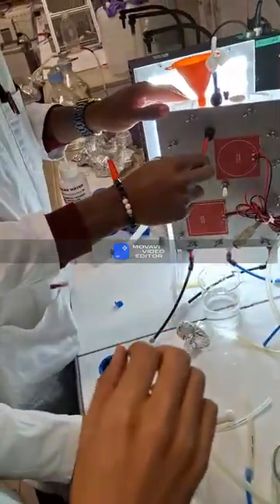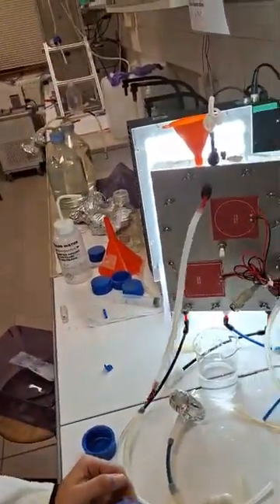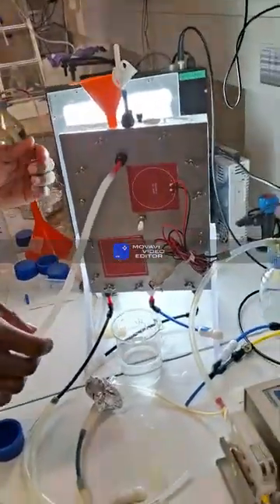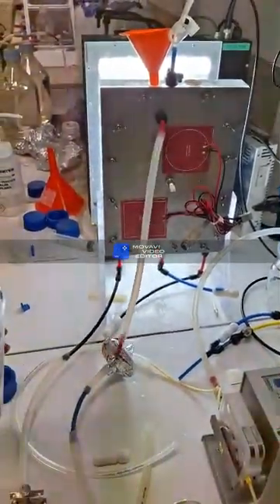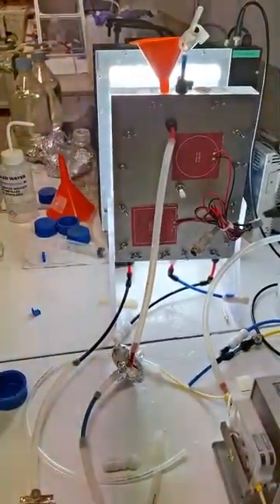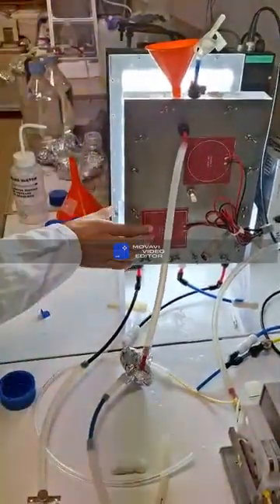What was the main problem? It wasn't fixed. No, it was the wrong place for this. One is for removal of nutrients, and this area is the outlet. Why is the output so high? This part is just to have the good volume, just 1 liter, because 1 liter is right here.